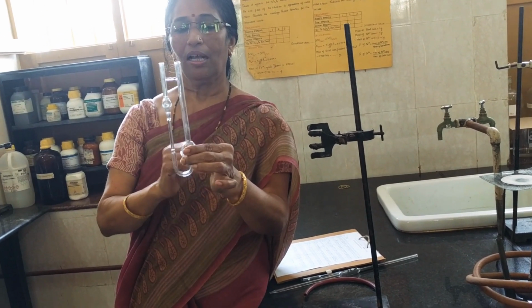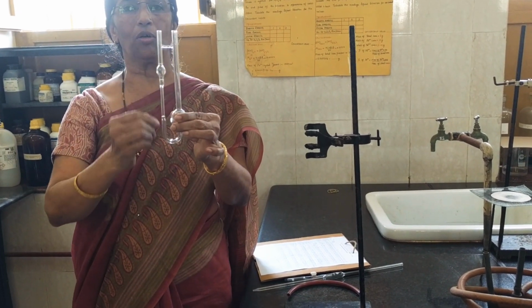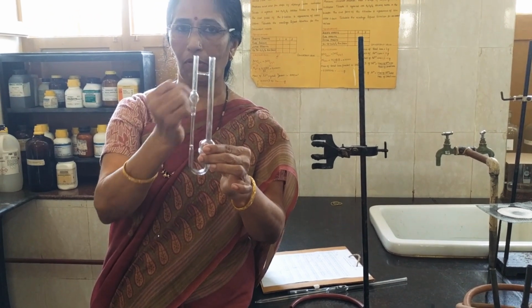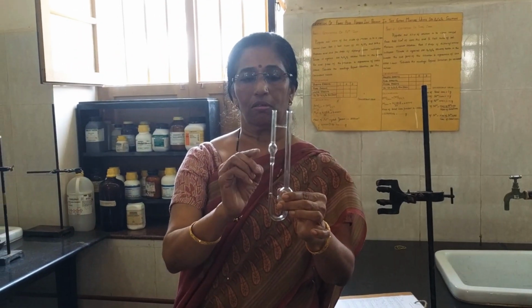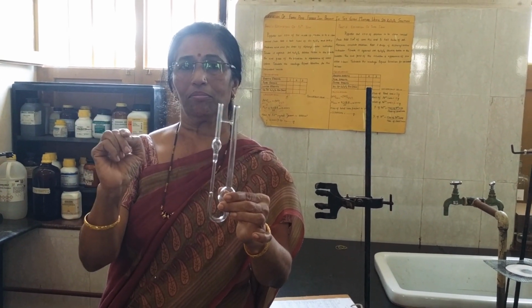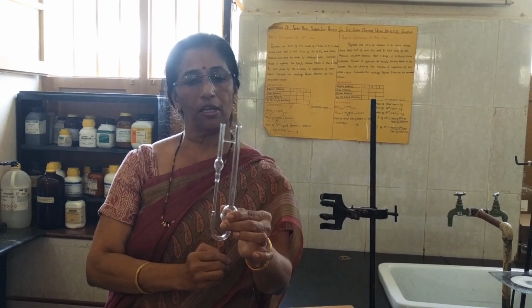Since I did relative density, I will be doing relative viscosity, and I am finding out the viscosity of my liquid as force per unit area, that is the resistance offered by the liquid for the flow as a function of time. Hence, my unit for viscosity is force, which is Newton, per unit area, per meter square, multiplied by the time it takes for the flow of liquid. Therefore, it is Newton per meter square into second. That is the unit of viscosity.